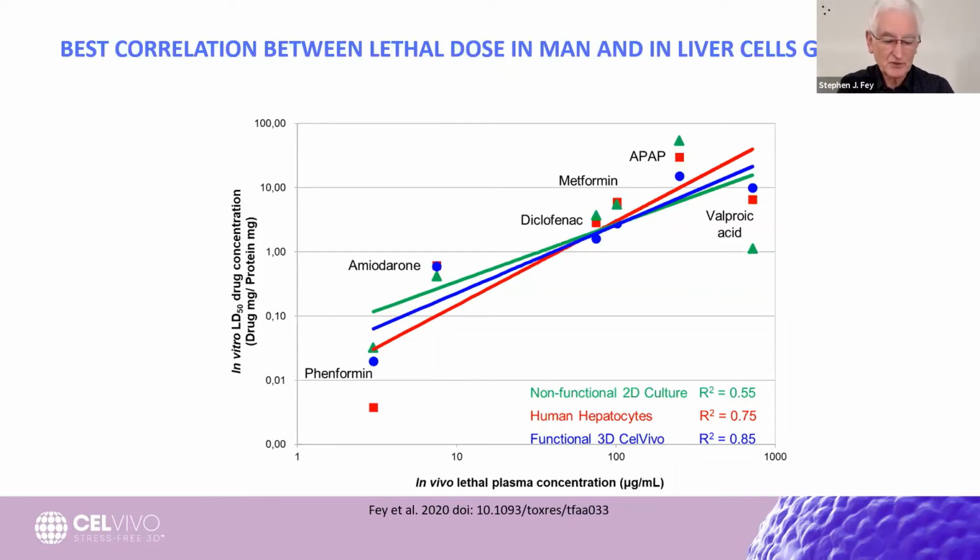So I hope this shows the power of a very simple system, a very reproducible system, a fairly inexpensive system, in using it for clinical research, drug development.